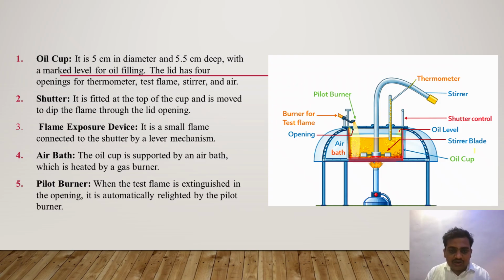The lid has 4 openings which are used for different purposes. One is used to insert the thermometer, another for the test flame, another for the stirrer, and one is a small opening for air which will support burning.